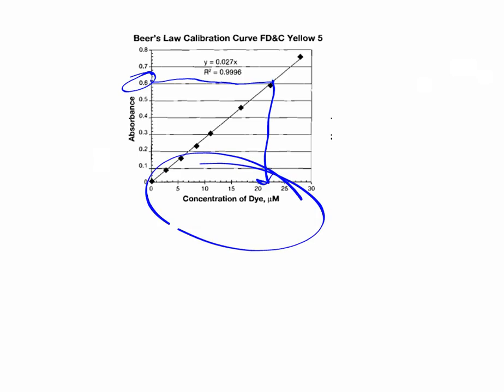That's what we do in a chemistry lab. The purpose is to determine unknown concentrations. So the overall purpose in the lab tomorrow is to determine the unknown concentration of Gatorade by developing a standard curve using known concentrations, reading them in a spectrophotometer, making a linear plot, and then testing the unknown. And that's what we're going to do tomorrow.